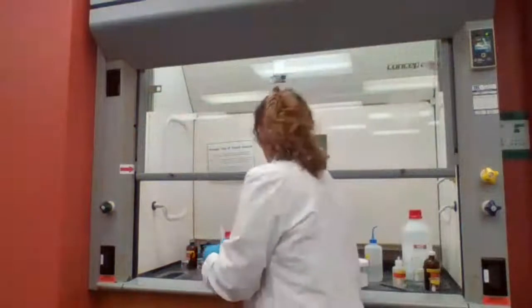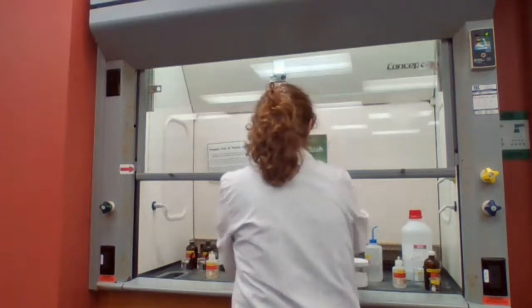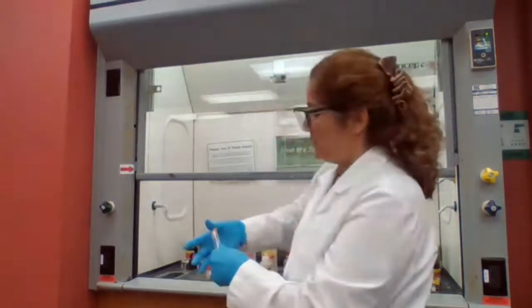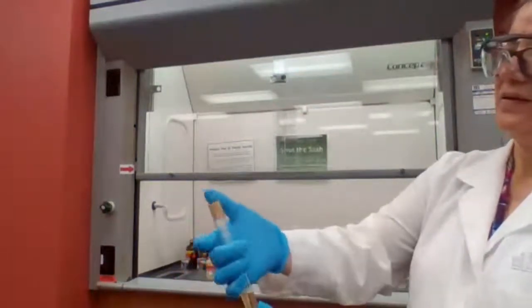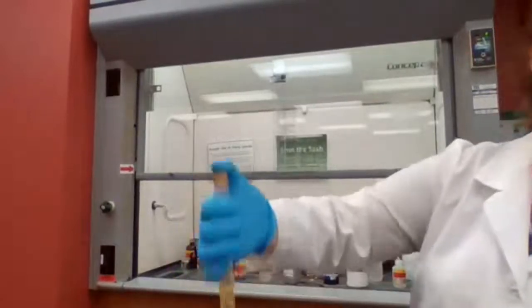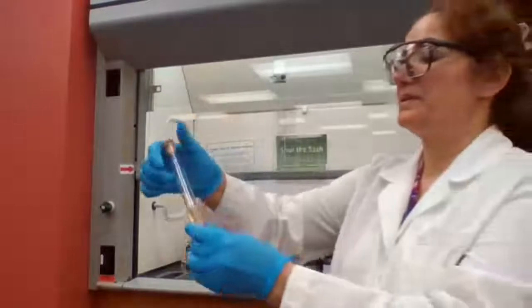I have 40 drops now. I have to close the container. Going to cap it using a cork. Mix it well and look for any precipitate.